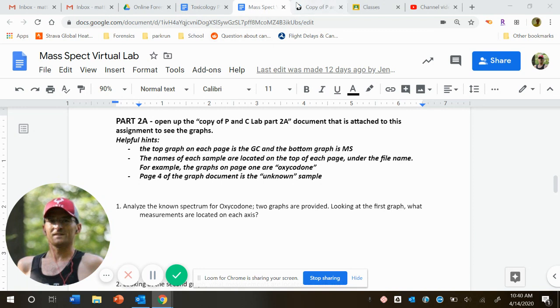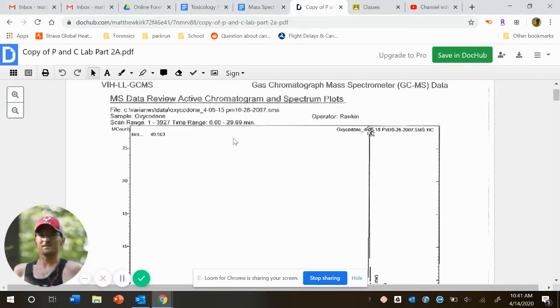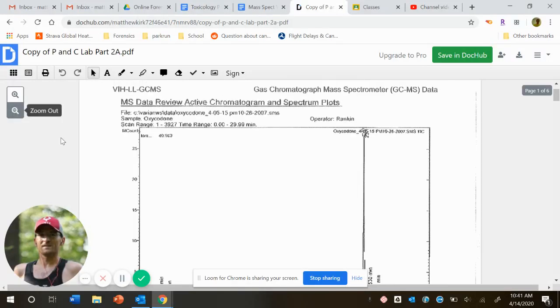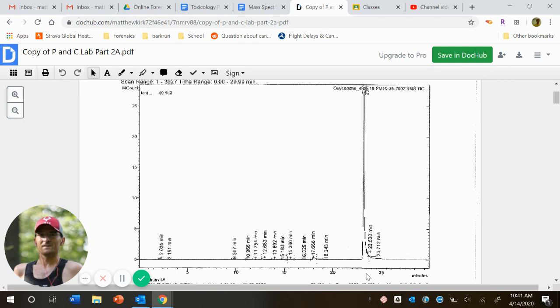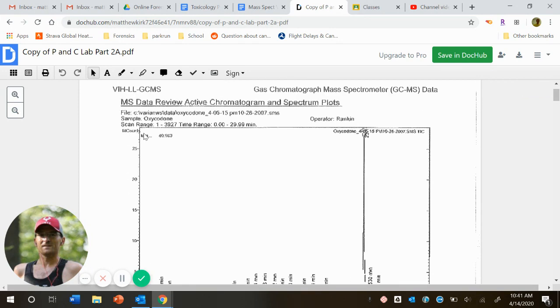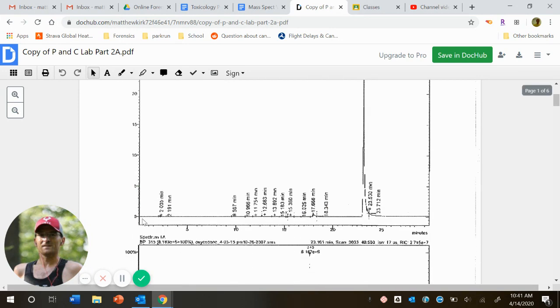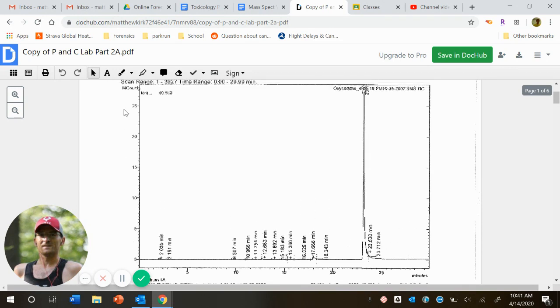So open up copy of PNC lab part 2a and let's just kind of make some sense of these graphs. So when we open it up, it told us that the top graph is our GC graph. So let me zoom out a little bit. So this top graph is GC. And notice as we look at it, kind of the left side, or really I should say our y-axis is count or intensity.